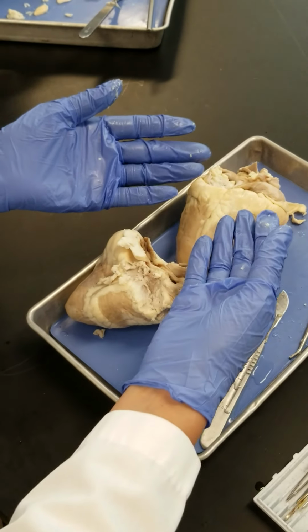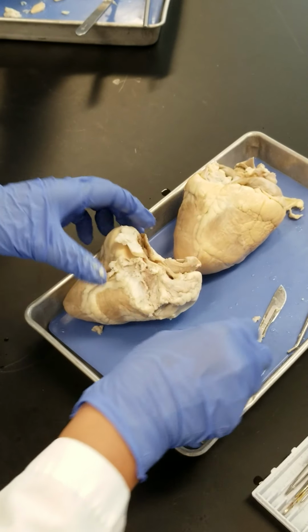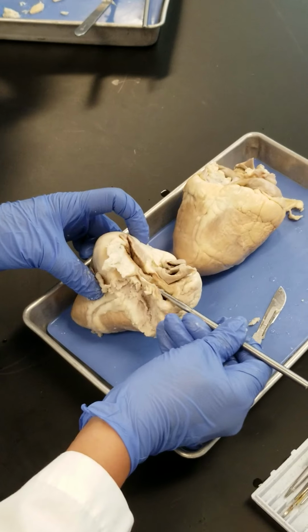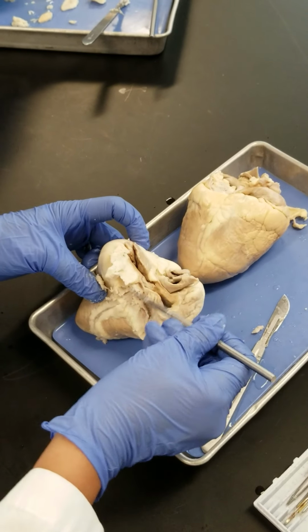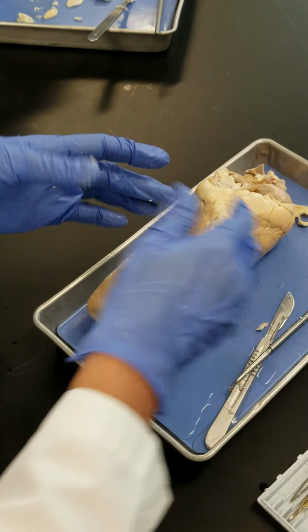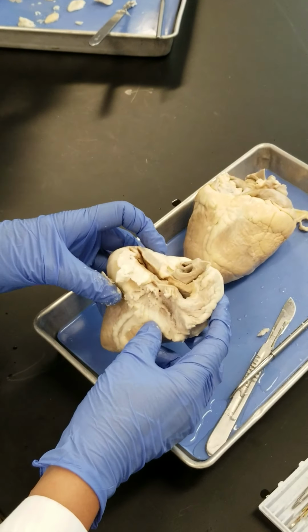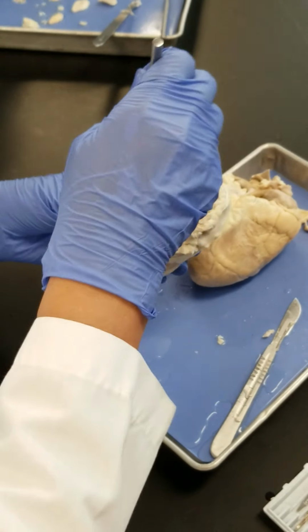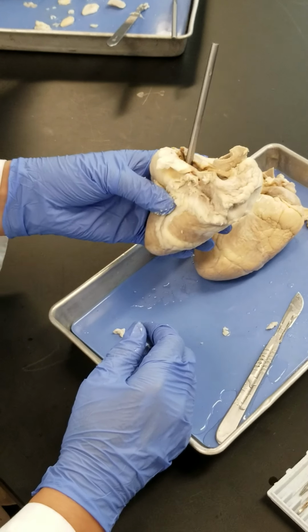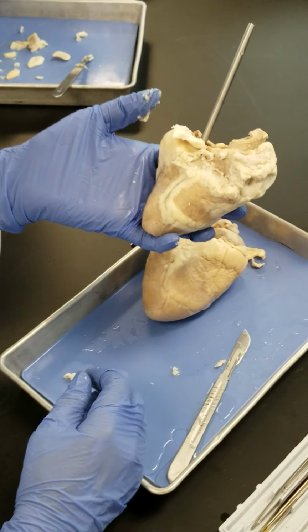And most of the time in these hearts, all have been cut. If you are very lucky, we see just an impression like the one that we saw here. We would see all those impressions here. If we are not that lucky, you just see a big hole that is the whole left atrium. But still, I may ask you which vessels are going into this chamber. You should use your knowledge and what you see.